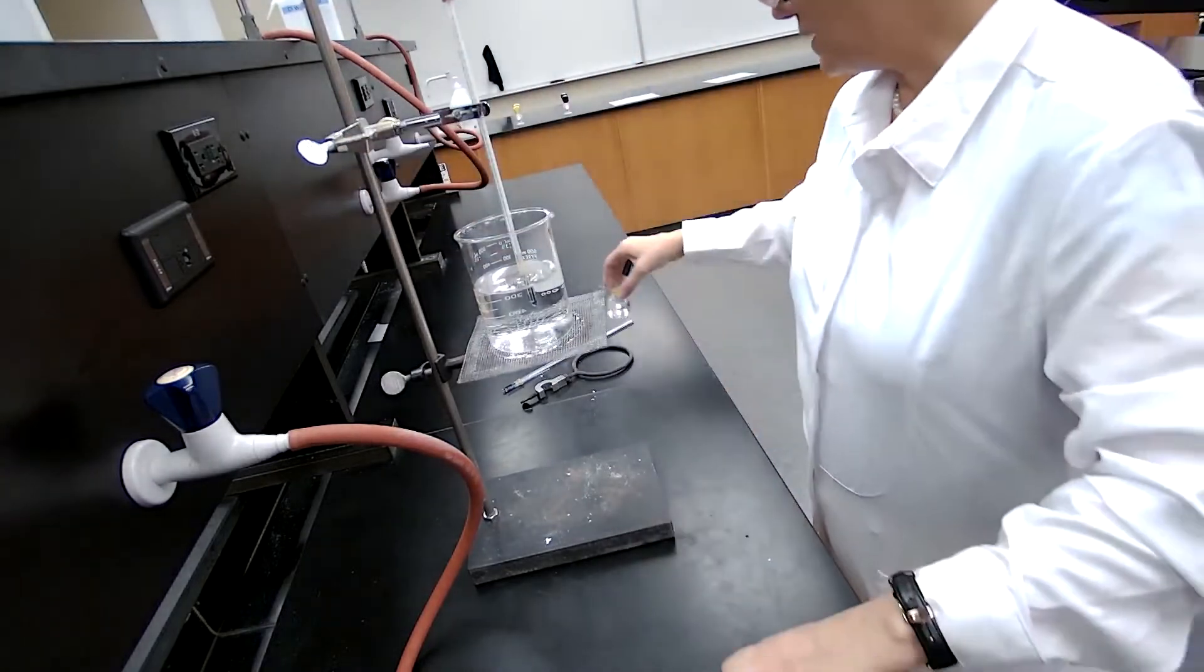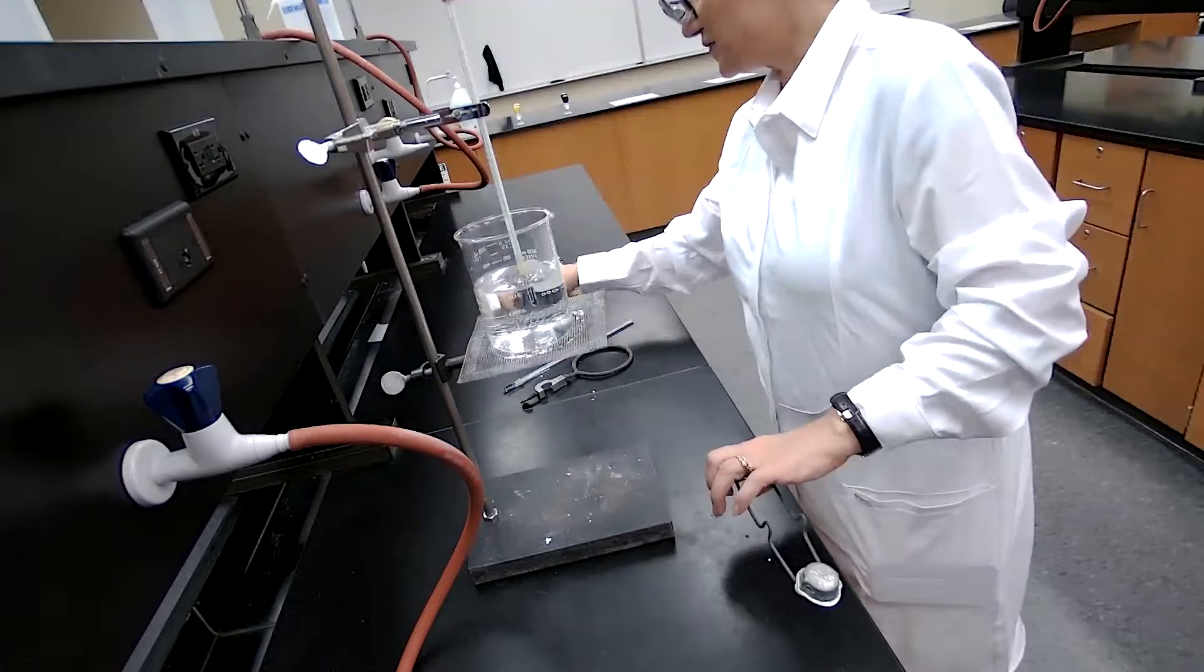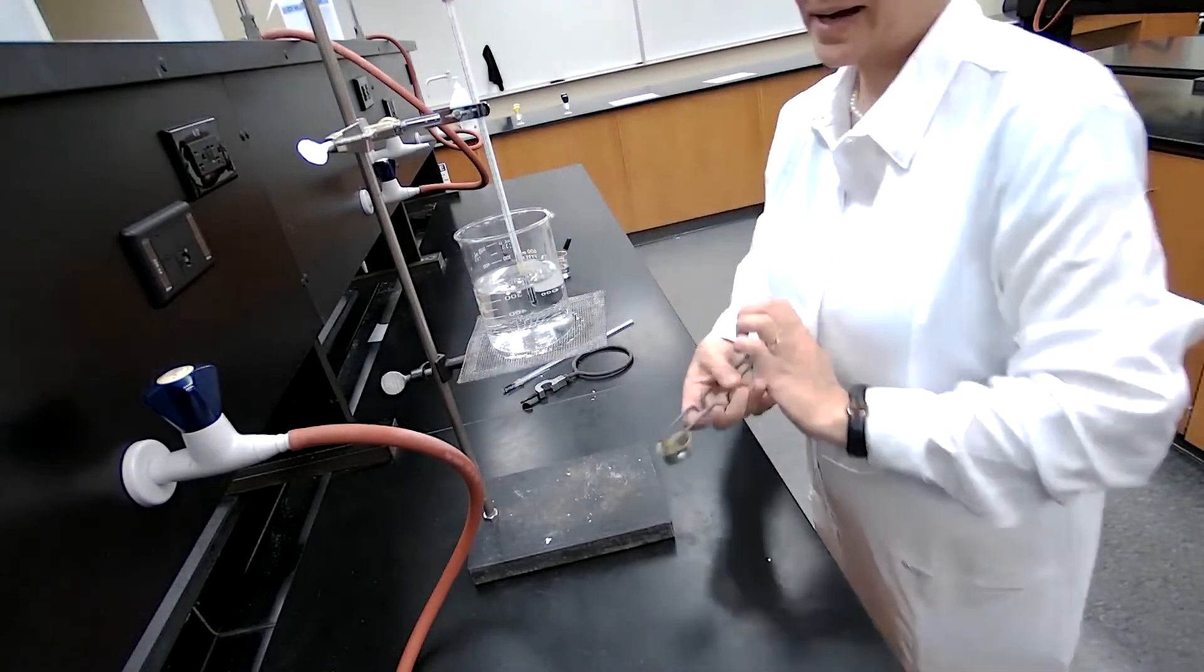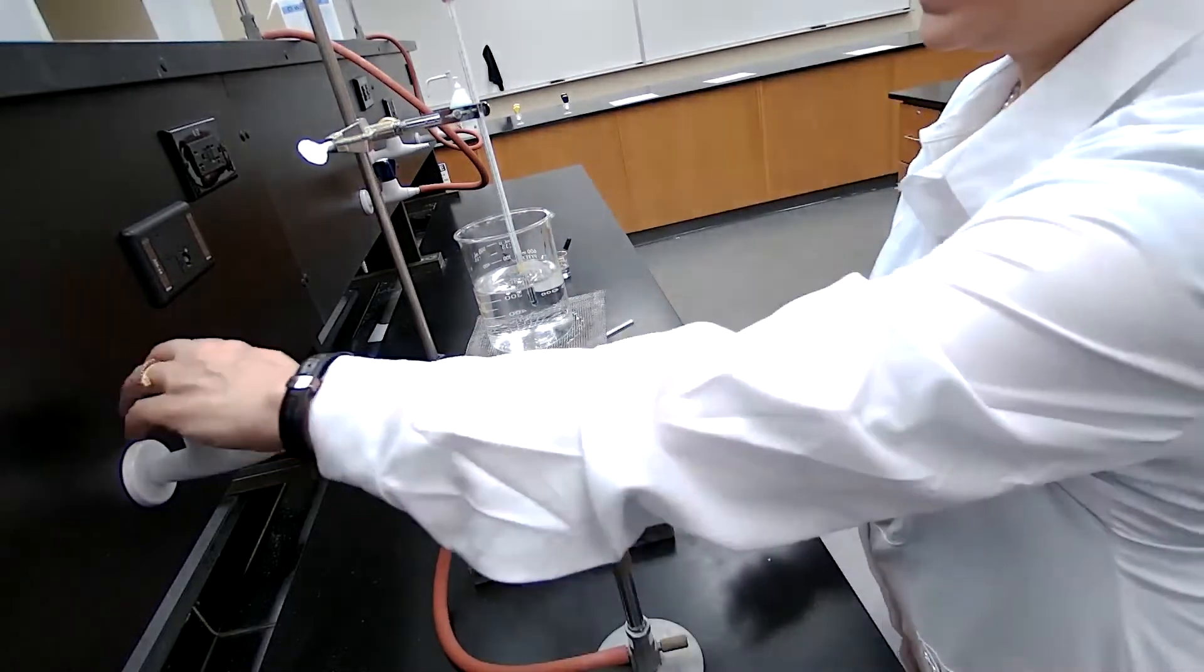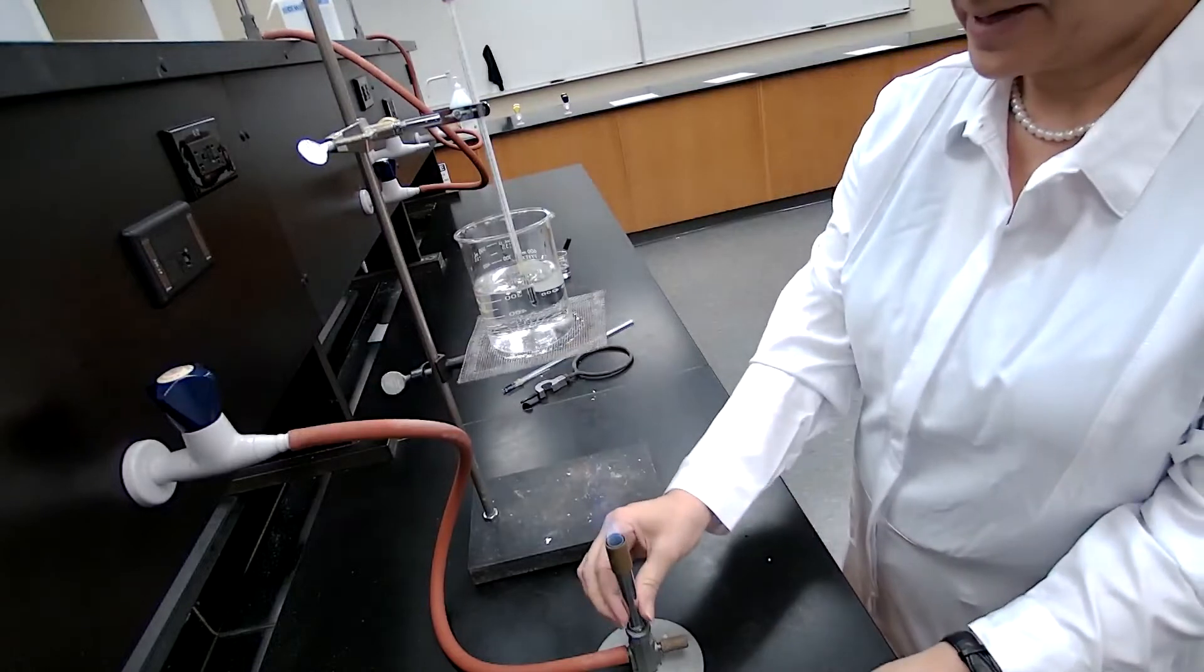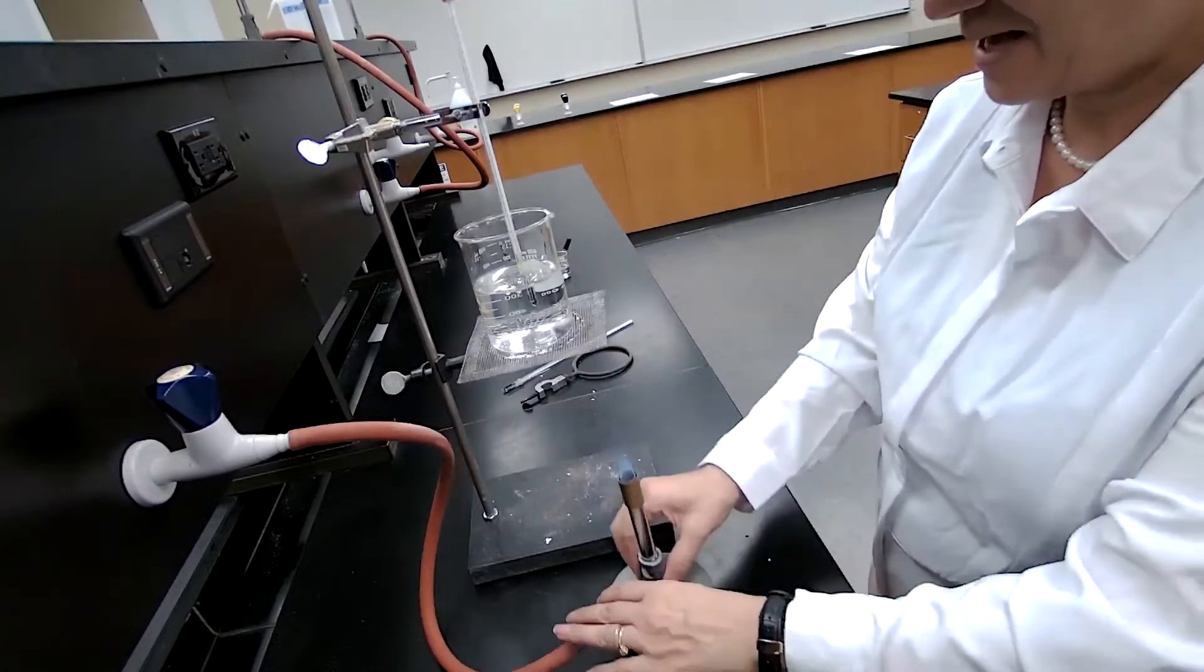I'm going to turn on the Bunsen burner. Since ethanol is flammable, I have to move it away. And then I will turn on the Bunsen burner, adjust the flame, making sure that it's not yellow color and it doesn't make sound.